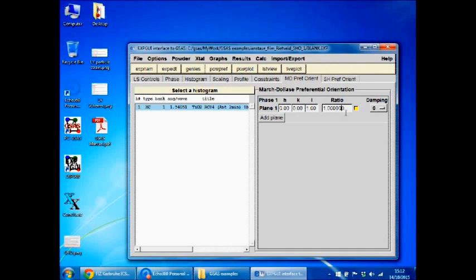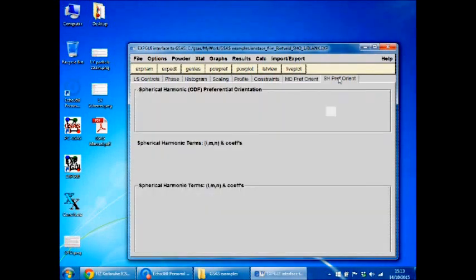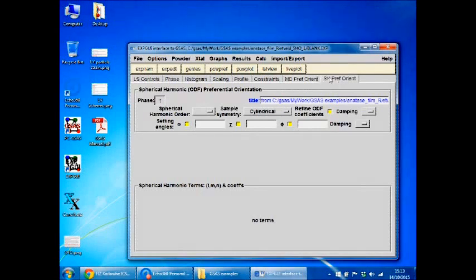But what I found with films, the thin films I've made, is that once you enter one plane, it doesn't often work for one plane, and you enter 2 or 3 planes to make it work, and you're opening Pandora's box because there's so many different possible combinations that could work. So rather than doing it manually, it's better to just let the spherical harmonic model do that for you in many different planes and try and get a quantitative analysis in many different planes.